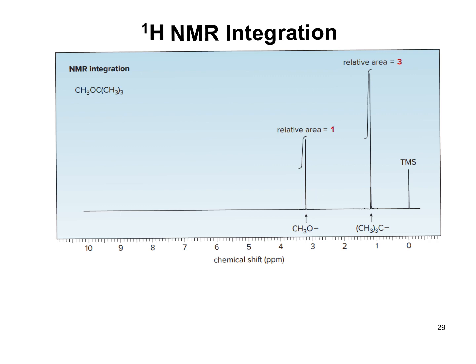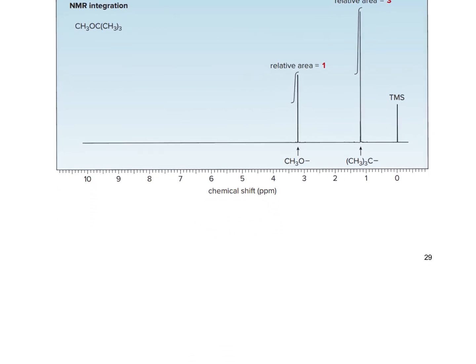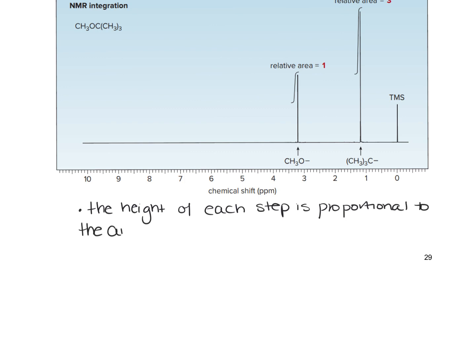Now, the height of each step is proportional to the area under the peak. And that, in turn, is proportional to the number of absorbing protons.